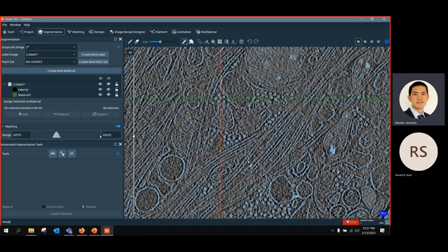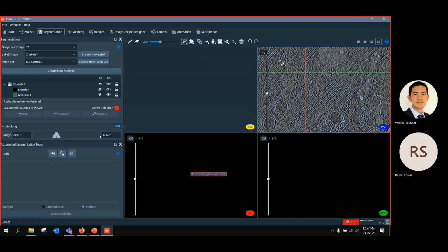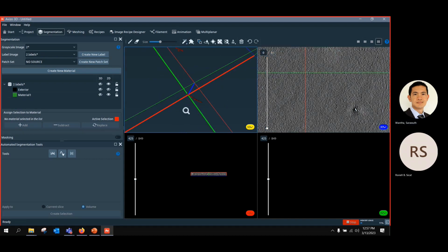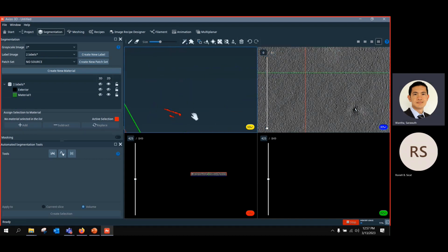For example, if I want to select the object here, you have to follow many parts of them to really segment it like this. And in the viewer, it's almost impossible to really see the things. As you have to do it one by one, it's still manually a lot of time to do the segmentation.